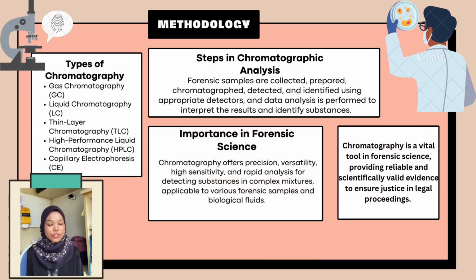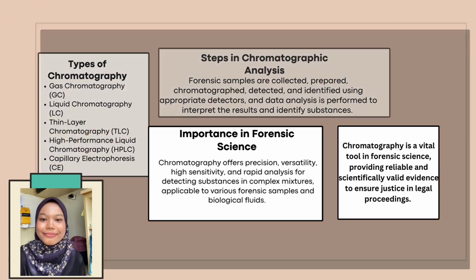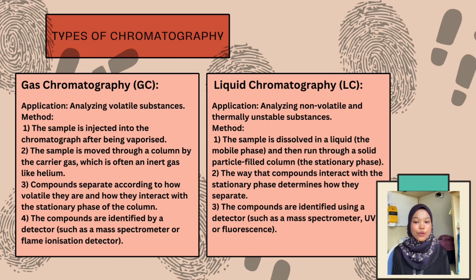Next, for methodology, we have types of chromatography, steps in chromatographic analysis, and importance in forensic science. Basically, chromatography is a vital tool in forensic science, providing reliable and scientifically valid evidence to ensure justice in legal proceedings. Firstly, we go for types of chromatography.